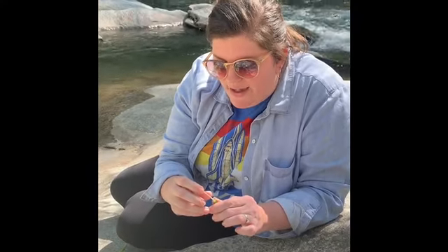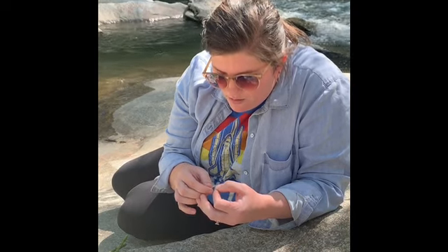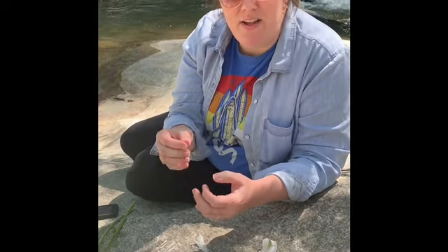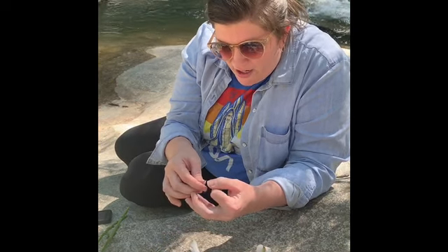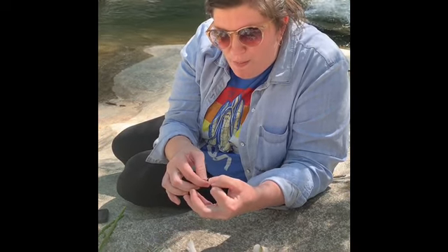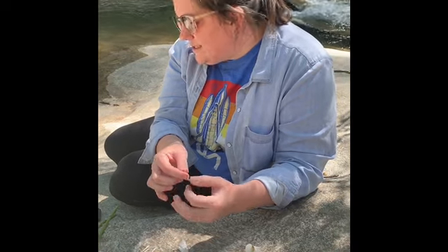Alright, so then you see this part. If you look very carefully at this part, it's hard to see, but at the very tip, this is the female part of the flower, and this is called the pistil. Alright, so up here you have this little bitty opening. At the very tip of this, again, this is the female part of the flower. You see that there is a little opening. Alright, this little opening is called the stigma. And that is where the pollen goes down.